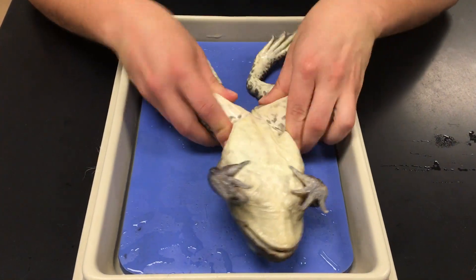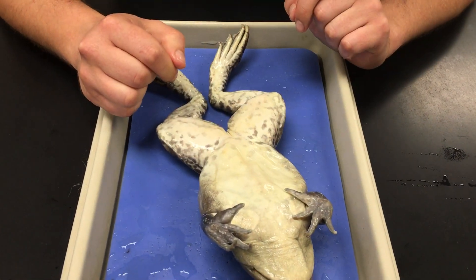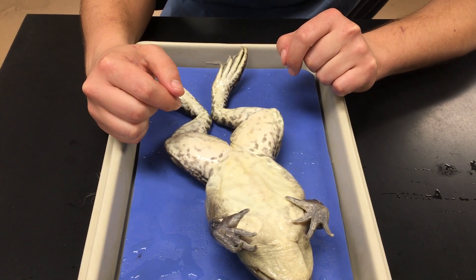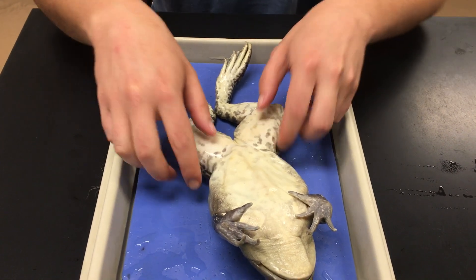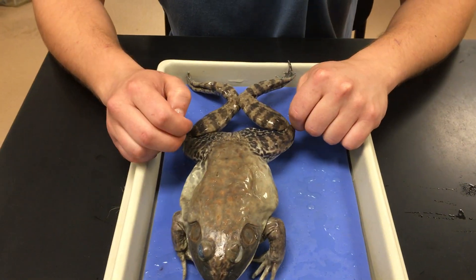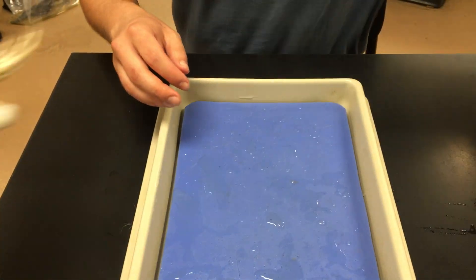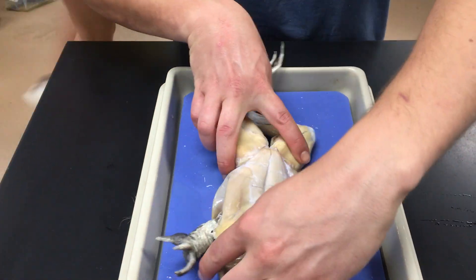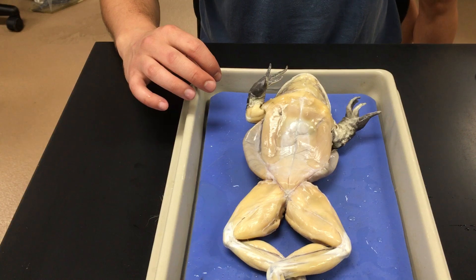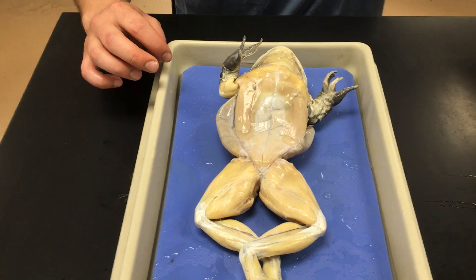We also have the cloaca — the opening at the back end of the frog where they release waste. That satisfies everything we need for the external anatomy of the frog. Now let's take a look at some musculature. You have a list of muscles on page 98, and a diagram outlining those muscles on pages 100 and 101.